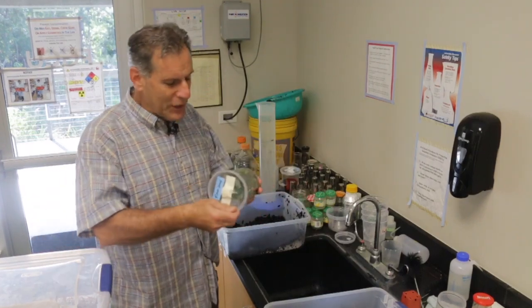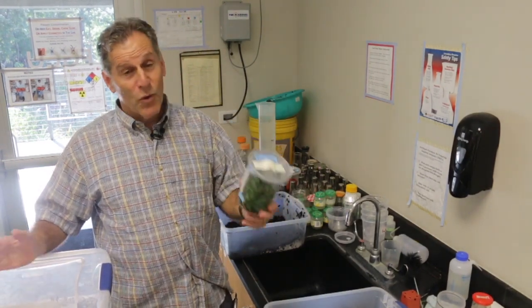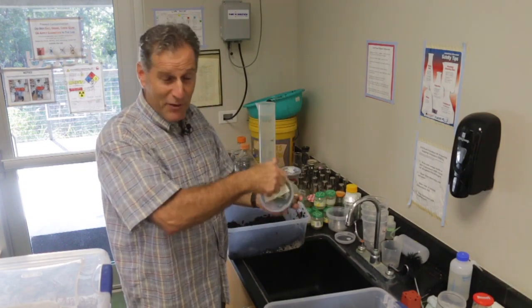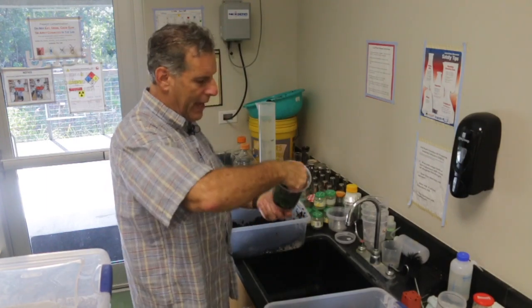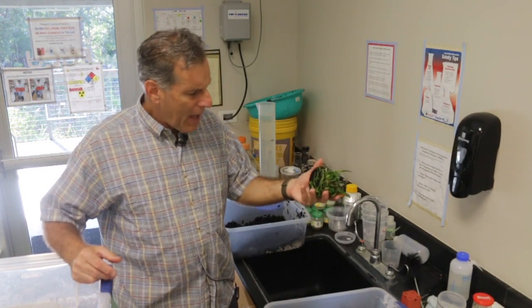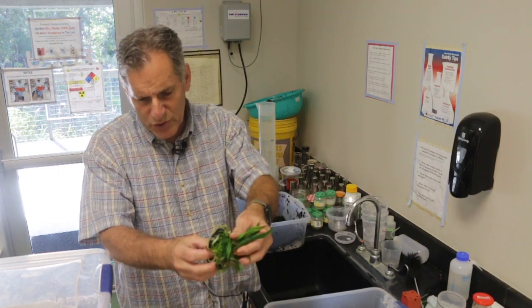Okay, so what you do on this when you deflask, the main thing that I want to emphasize is how delicate the roots are in orchids in general, but especially in the deflasked plants. So what I'll do is I'll open up this flask, and I'm right in front of the sink here. Then I pull out the mass of orchids, and they come right out. I will then shake off the medium, a little bit, but not much. I don't want to damage the roots too much.